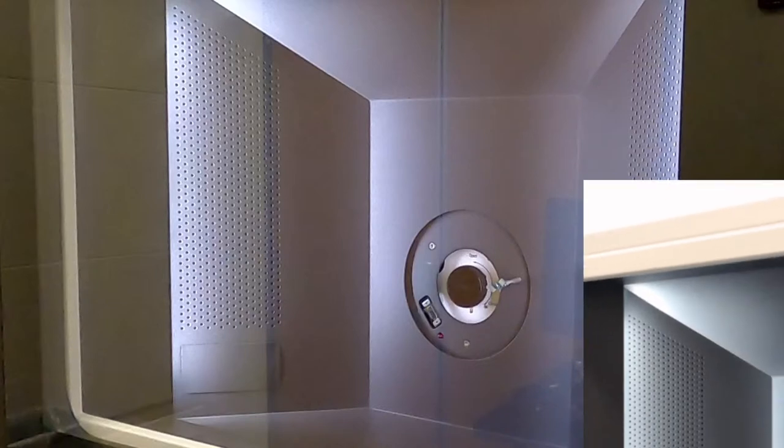You just remove the holder as I showed you in the beginning. So pull out and turn clockwise, take out. And then you want to remove the sample from the holder. Again, I will show you the holder operations next time when you do the one-on-one training.